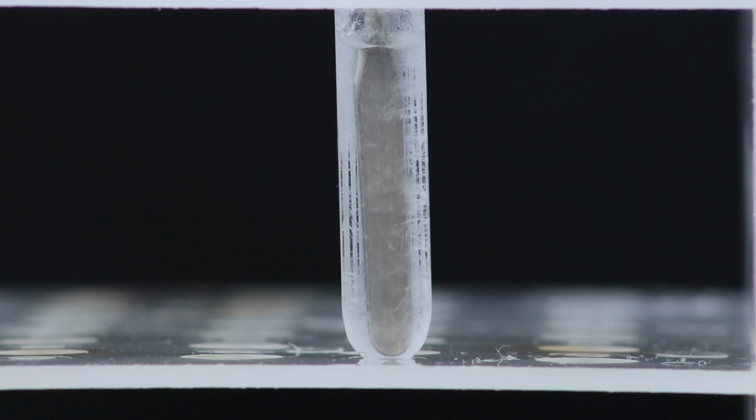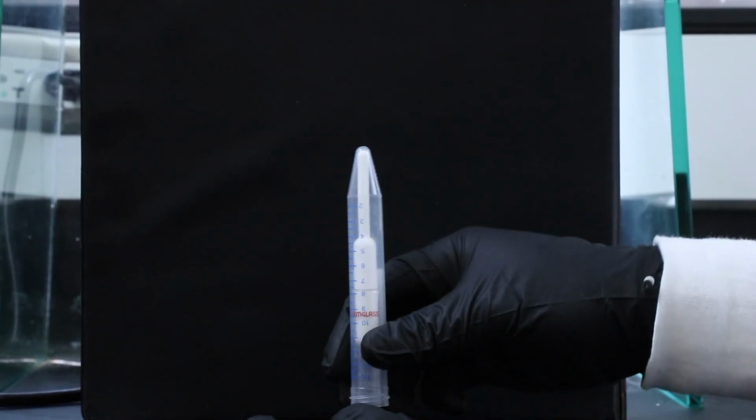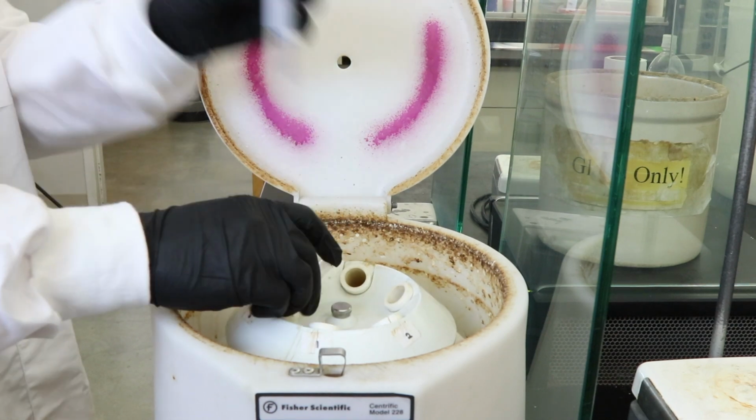Once that's done, I'll scrape the sides a little bit just to break up the crystals, and then use a stopper and a polypropylene test tube once again to remove the liquid from those crystals, and I'll centrifuge it just for a few minutes.